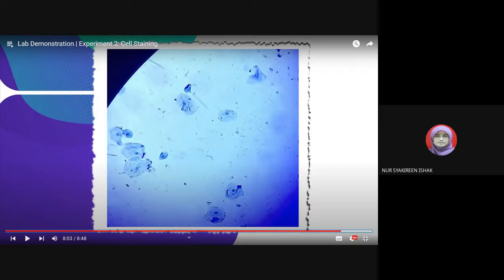Okay, so kita ada contoh lain, kita ada stratified. Stratified maksudnya it forms layers of cell, layers of this flattened sac. So in this case of the oral cavity, the tissue that lines the oral cavity consists of squamous, stratified squamous epithelial cell. Betul ke tak? Lining your cavity.